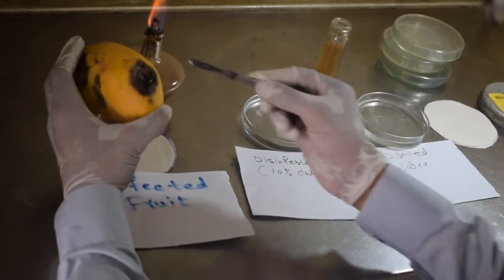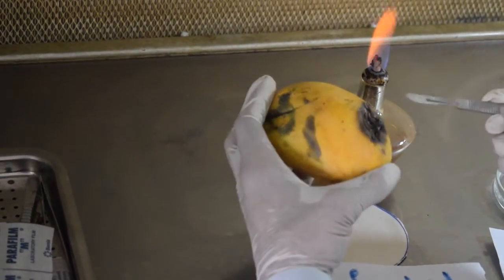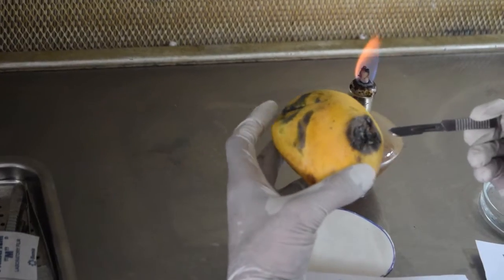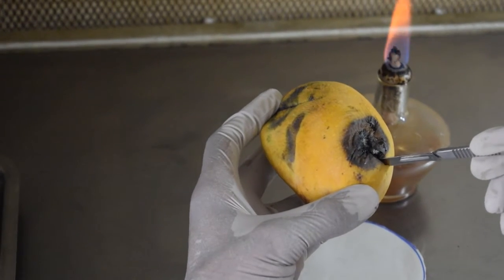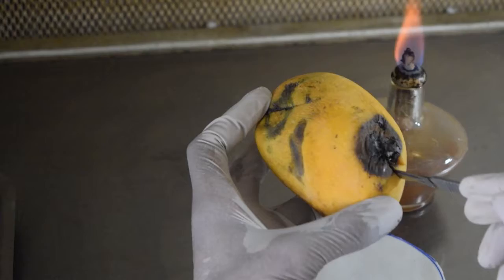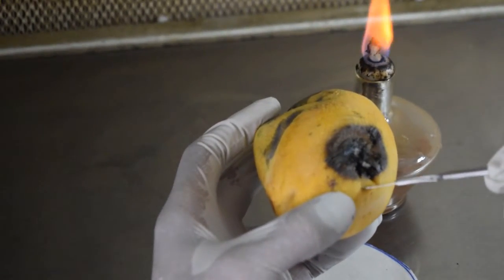You can see here that I already disinfested this infected mango. It is a rotten part, basically, and I am cutting it from the edge. We should cut from the edge because we should have some healthy part of the infected mango.